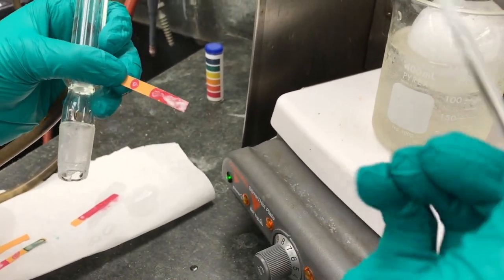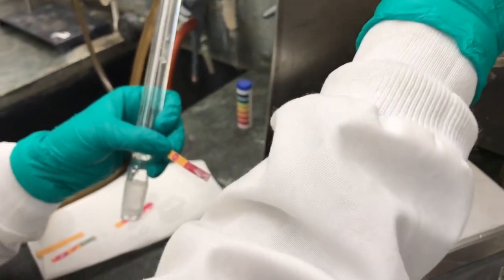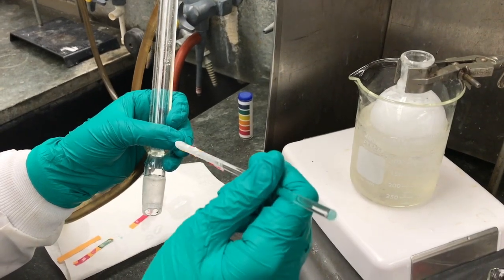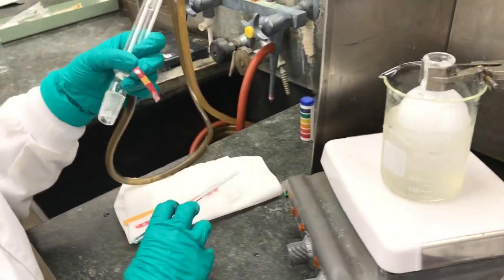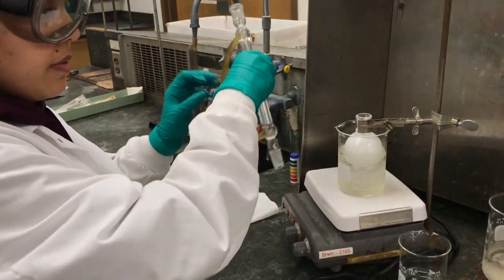So it's not the foam. If you're unsure whether it's foam, maybe stir it again, add a couple of drops of water into your mixture and test it again. As you can see, this is red, so that means our mixture is now completely acidic and ready for our workup. We'll get back to you soon.